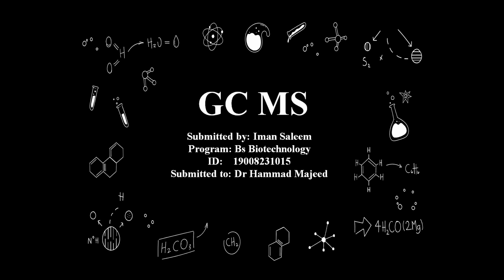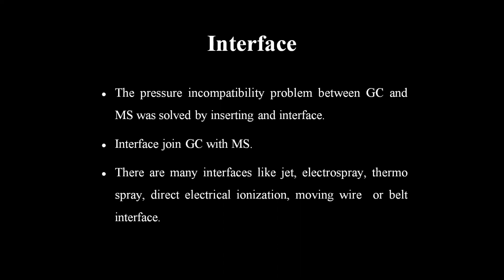My ID is 015. Today I will discuss GCMS, which is abbreviated as gas chromatography mass spectrometry. First of all, I will discuss what is the interface in GCMS. The pressure incompatibility problem between GC and MS was solved by inserting an interface. The interface joins GC with MS.